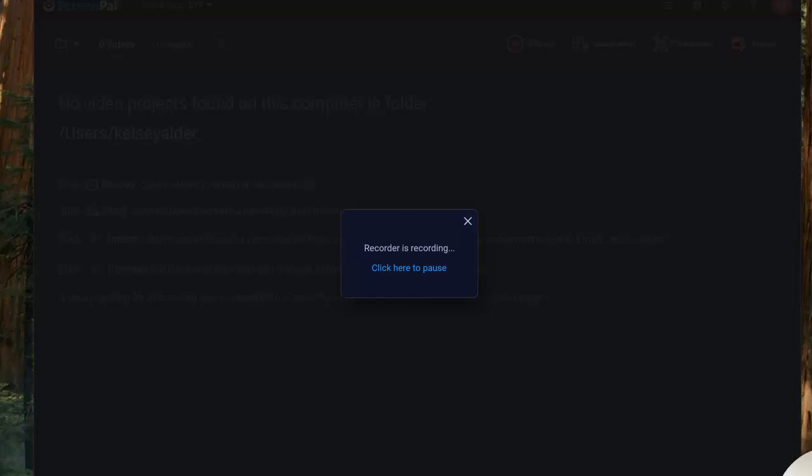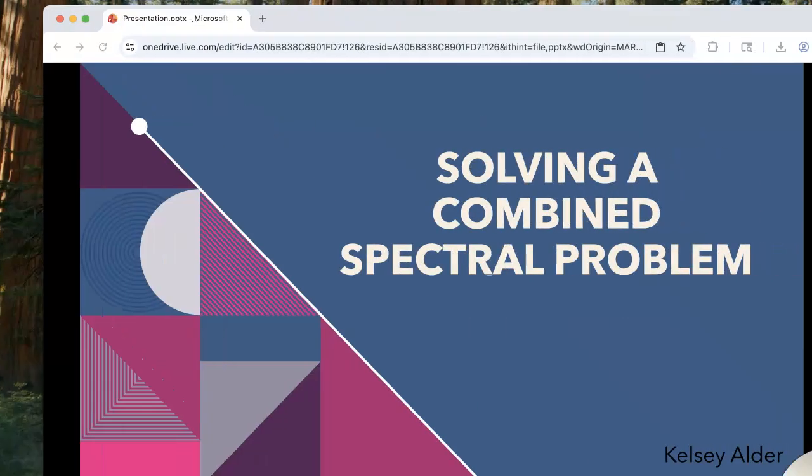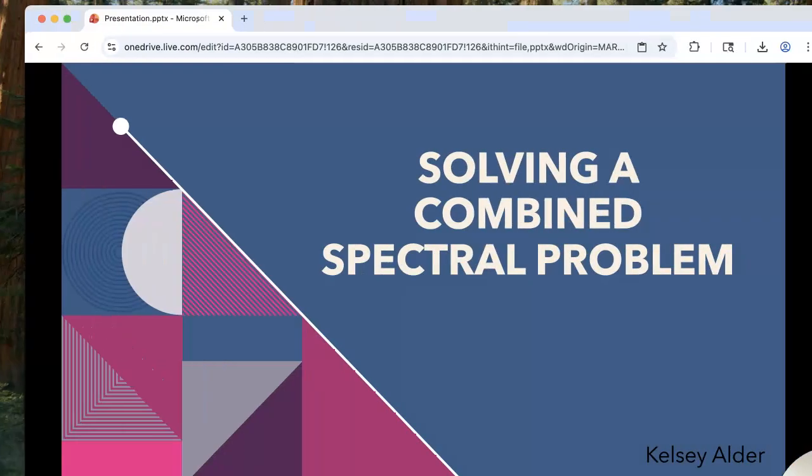Hi, my name is Kelsey Alder, and I'm going to be going through an unknown spectral problem today. So here is my PowerPoint presentation, and I'm going to walk you through the steps that I took.